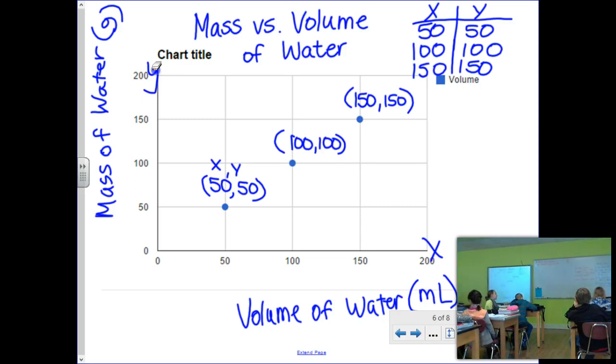So now you're going to go to 100 and then you're going to go to 95.3. And then make sure you reach the mark.